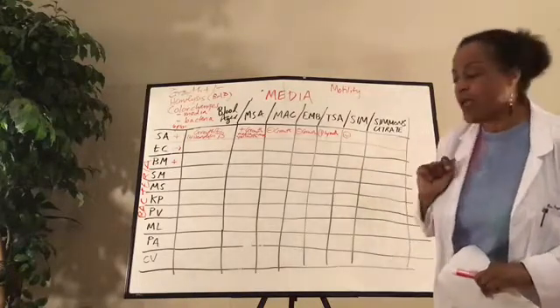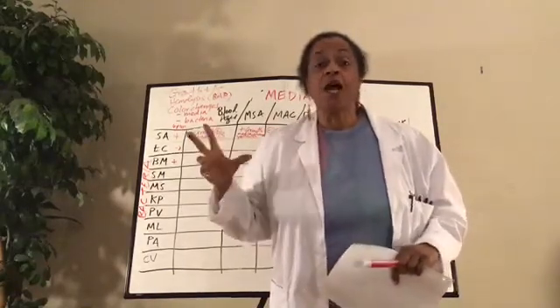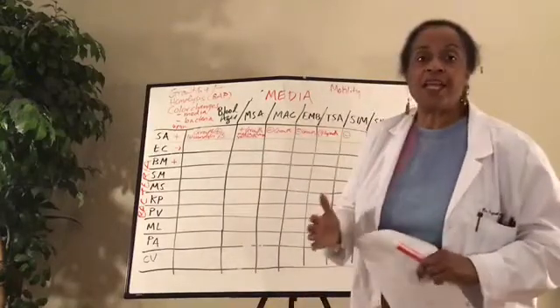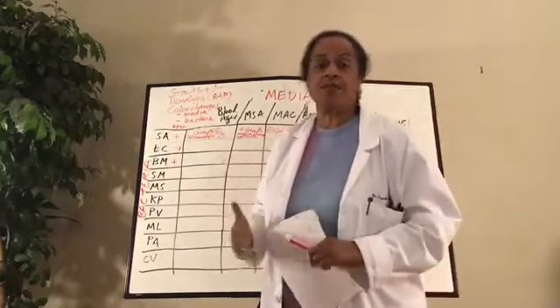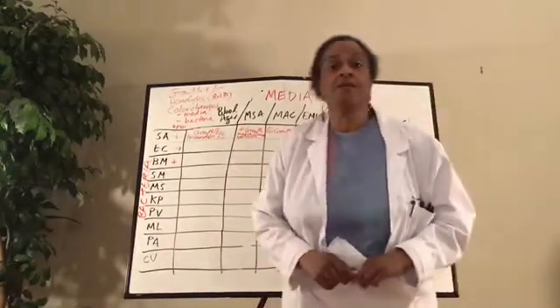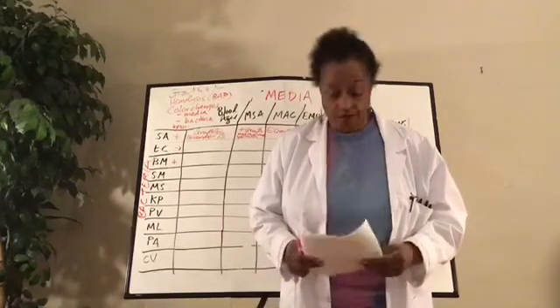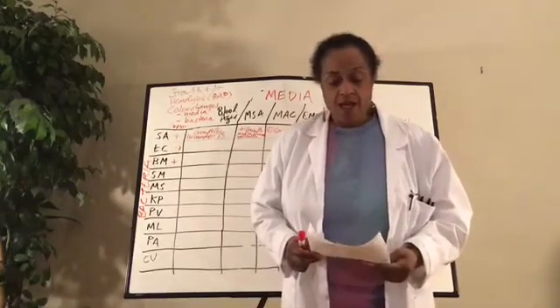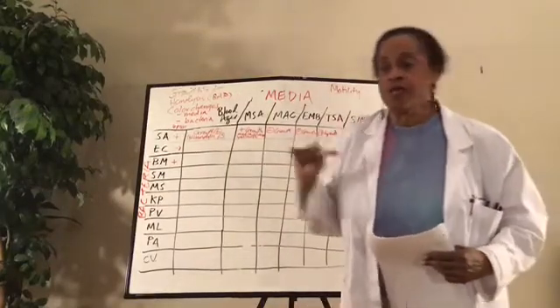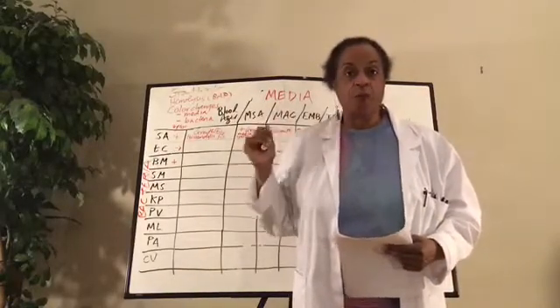So your investigation is what's going to determine how easy your unknown is going to be. Once you get your unknown, and I give you a little bit of information about it, you're going to tell me the steps, what you went through, and then you'll be able to use this chart as a sheet that is going to give you the information that you need. This will go under assignments. I will make a new little space where assignments can be turned in for your formal reports.